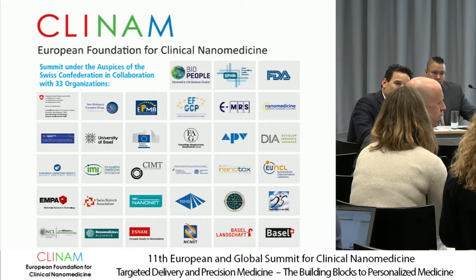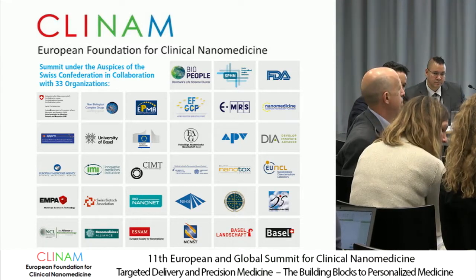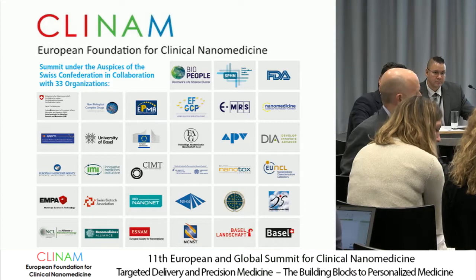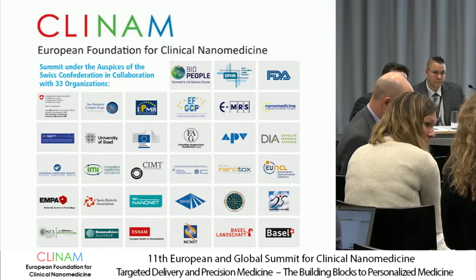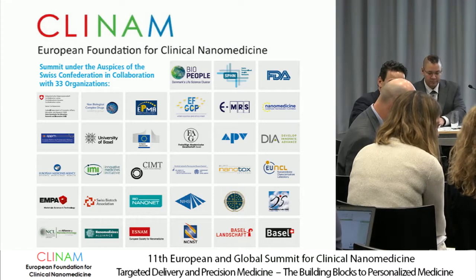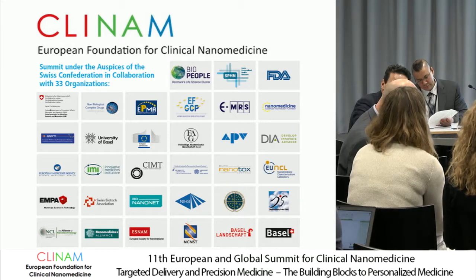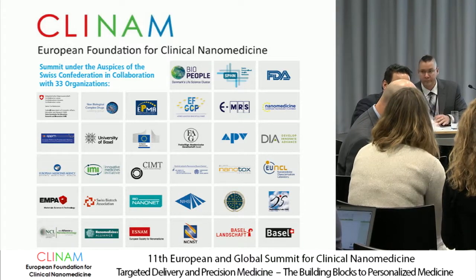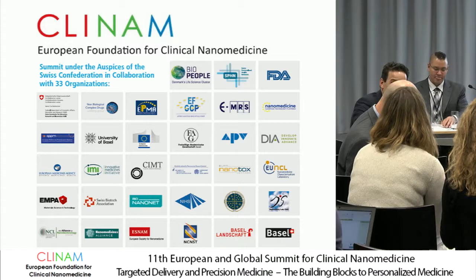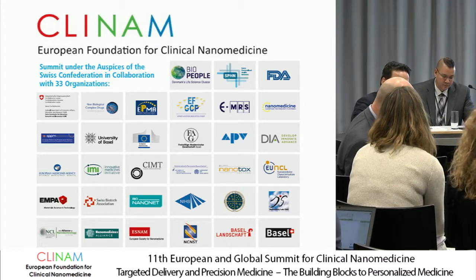But what we are working with within this framework is the fact that there's still a mandatory requirement for sizing, and DLS, FDA and EMA speak DLS first. Show us the DLS. Right or wrong, that's exactly the problem. But I agree, and this is why we're educating. This is why we have Frank in the session here discussing and providing information. Our slides are going to be sent to them. So the education process is based on mutual discussion of the scientific evidence.